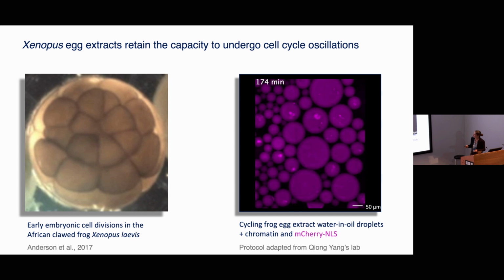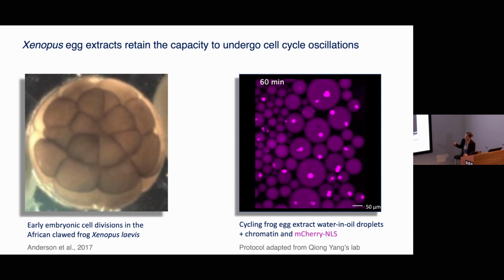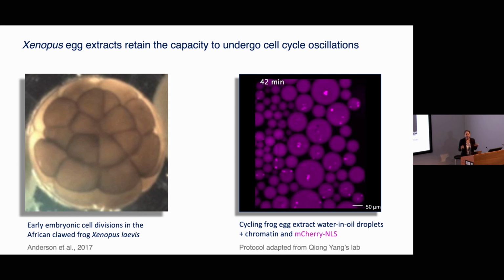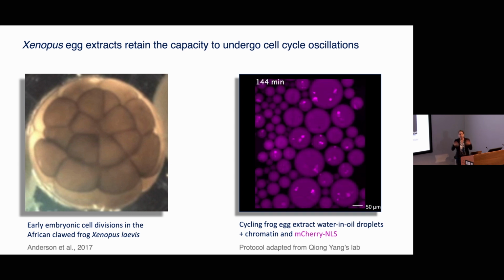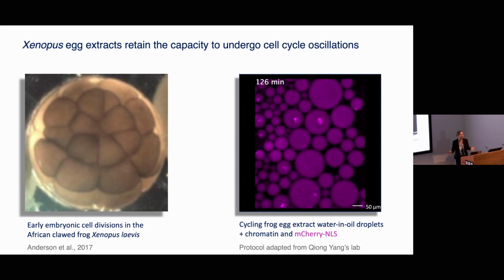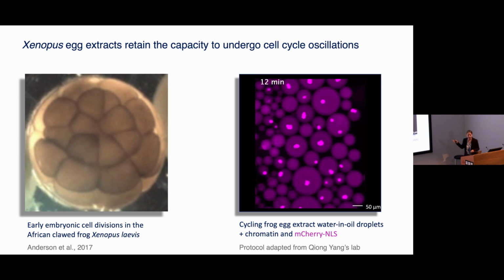And so, if you look very closely at these movies, you can also appreciate that the area of the nucleus becomes bigger and bigger, arguing that DNA replication is also still fully functioning, as Alessandro has told us this morning.